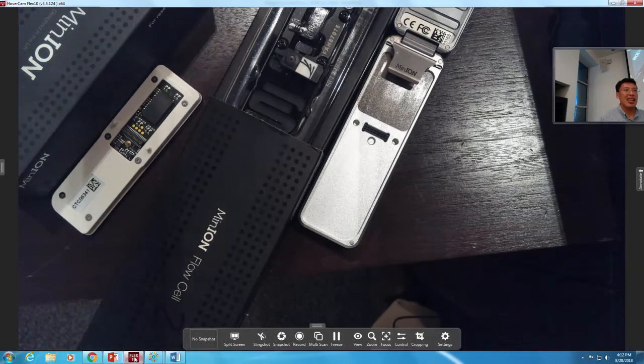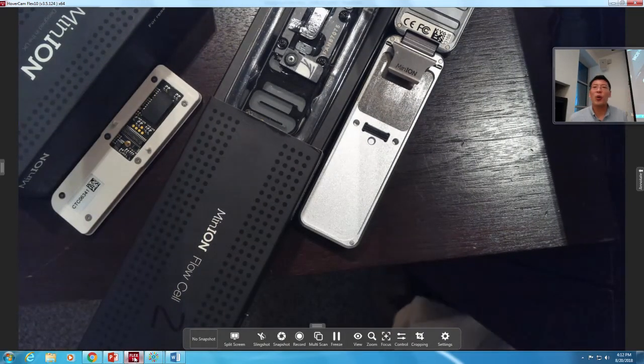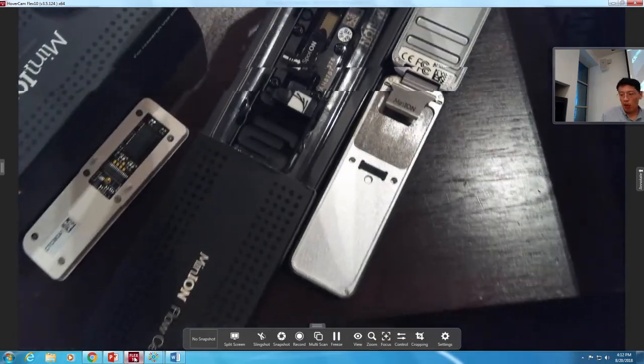So this is a really neat design, and so far, of course, there's a problem with this technology. The error rate is very, very high. In our hands, the accuracy is about 88%, meaning that you still have 12% that are wrong. So that is not good enough to do the genotyping, but it's good for a lot of other applications: figuring out what bacterial species are in there, and whether there is a virus infection, and those types of applications. So let me go back to my slides.